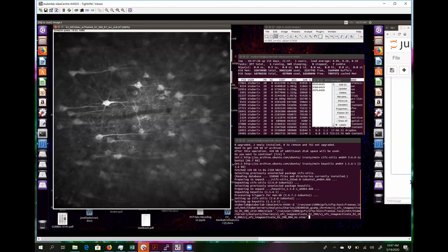But neuropil correction, I'll just tell you this. If you tell me a priori that you want 30% of your nucleus accumbens cells to be active to a particular behavioral event, and just give me the data, I can give you post-processing parameters whereby that will be true. So there's a lot of leeway here.